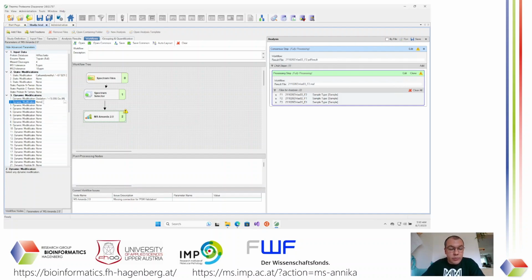And what we're also going to expect is monolink, so cases where the peptide is modified with the crosslinker but doesn't actually crosslink to another peptide. These are usually called dead-end links. The peptide is just modified on one residue with the crosslinker, and the other end of the crosslinker then reacts with something in the sample or in the buffer. What we usually specify for DSSO are the hydrolyzed, the amidated, and the tris form. You can select this down here, already pre-specified by Proteome Discoverer.